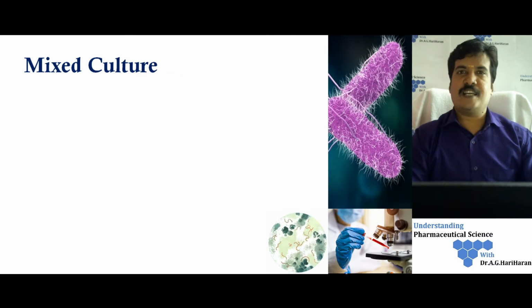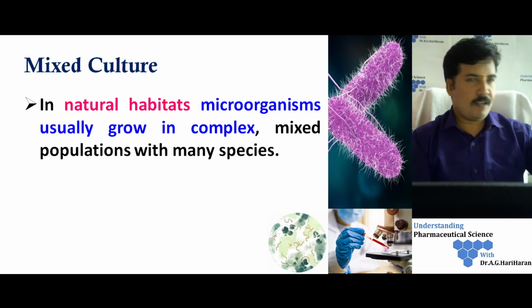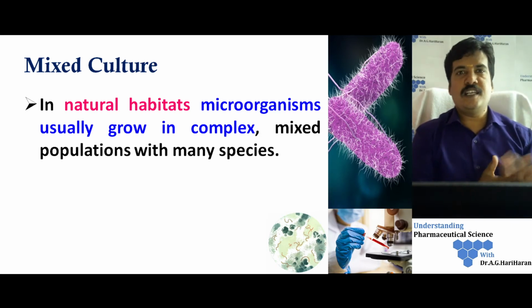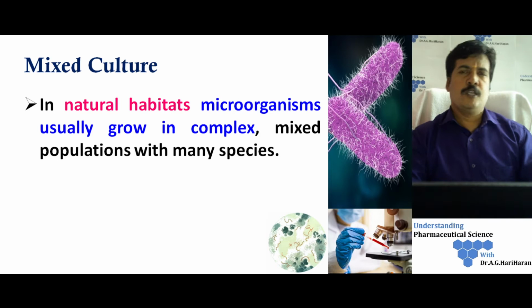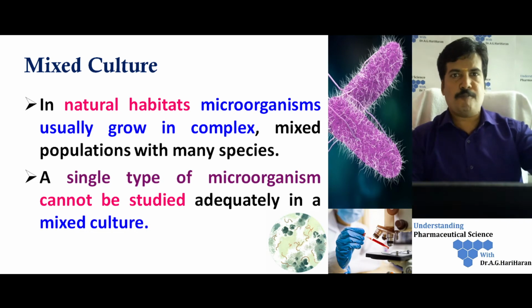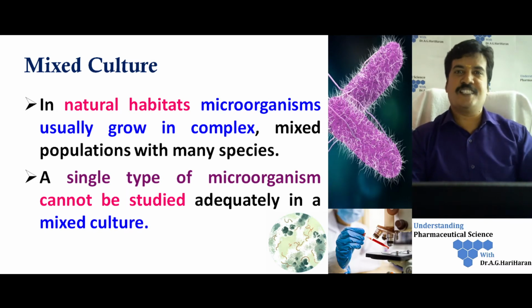So let us understand this technique by first understanding a mixed culture. If you take a small sample of water, air or soil in nature, you can see that each sample carries a mixture of microorganisms. Bacteria, fungi, or different types of bacteria will be growing together in this natural environment. It is a little bit complex, and it is very difficult for us to study a single type of microorganism present in this mixed culture state. So there is a need to isolate each and every microorganism individually from the mixed culture so it can be studied and explored in a better manner. That is how the need for pure culture came into existence.